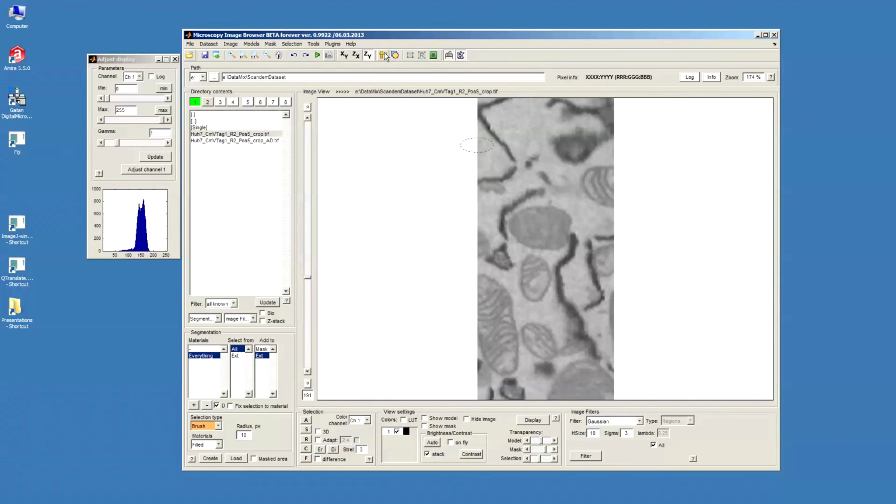The next tool is the measuring tool, so it is possible to measure a distance. The line that was measured is indicated in a green color, and it is a selection layer. In order to remove it, one has to press the C button here in the selection panel, or press the C button on the keyboard, which is a shortcut.